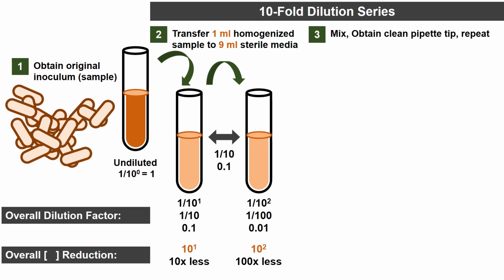What's the overall concentration reduction? You guessed it. I hope you're with me on this. 10 to the second. This is the 10 to the second dilution. It is 100 times less. Pause it there to think about that just for a second before we go forward. It's important that we're all on the same page. I know you can't ask me a question right now through the video interface. However, in class, we'll have plenty of opportunity to do this. And again, our office hours are available.